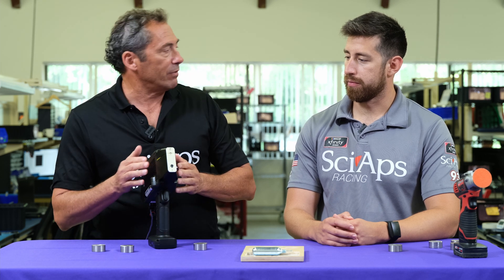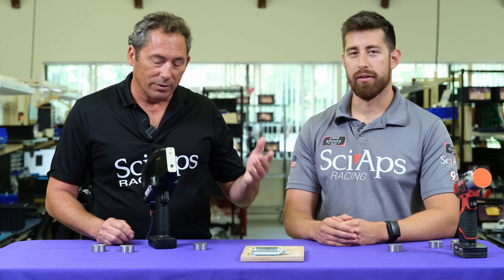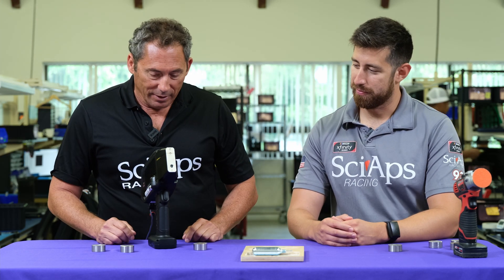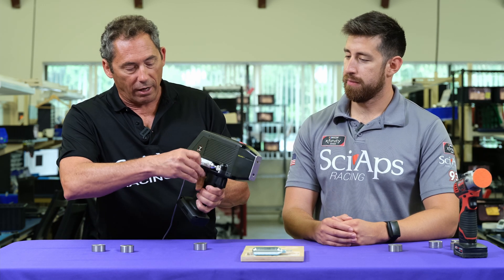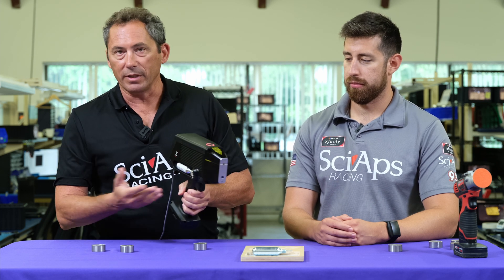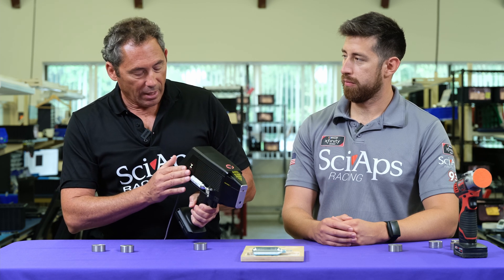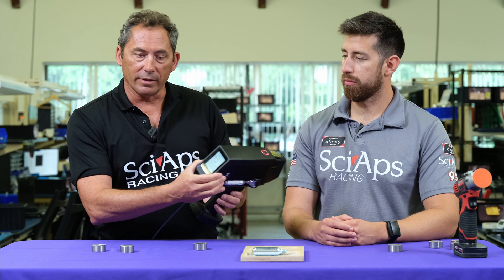We put some better heat syncing on, especially for some of these hot climates like Texas, Houston, Middle East. So it's a really nice looking analyzer. We moved the argon to the side instead of the handle, so you rotate it out, change it here, and it clips in — it's nice and safe in there, it's not going to fly off. And we put the display on the rear so when you're testing you can actually see it easily.